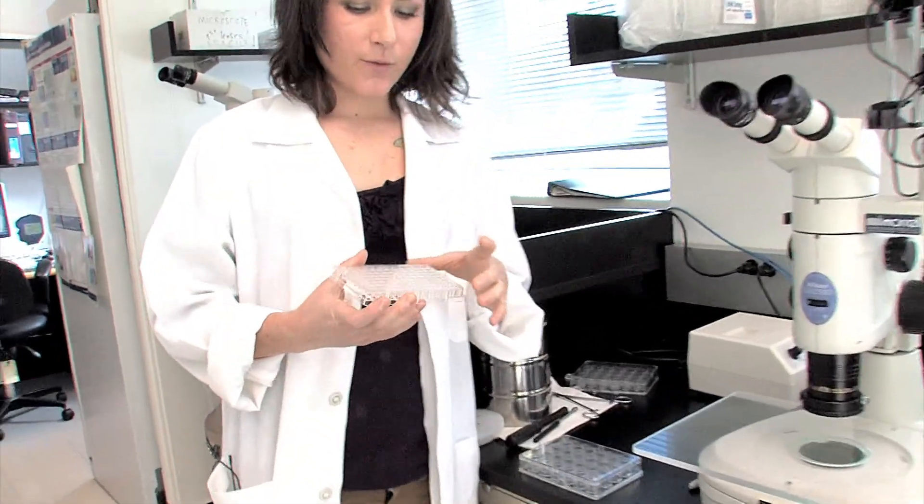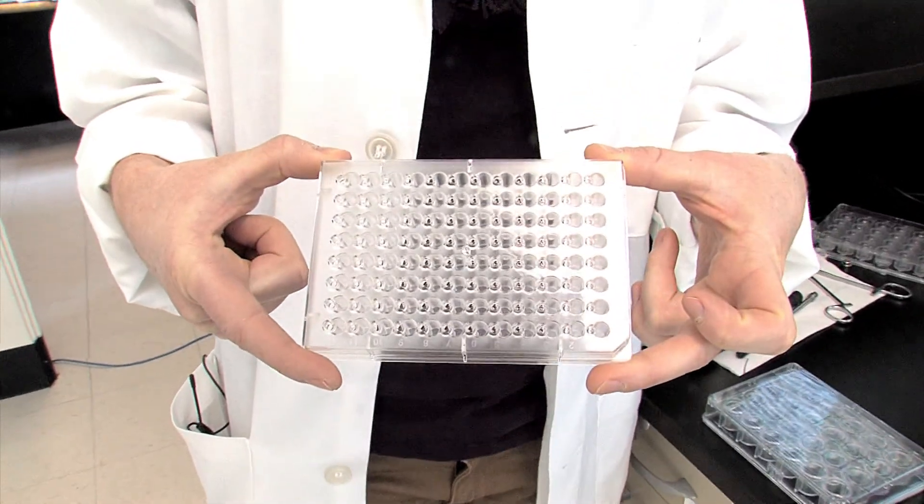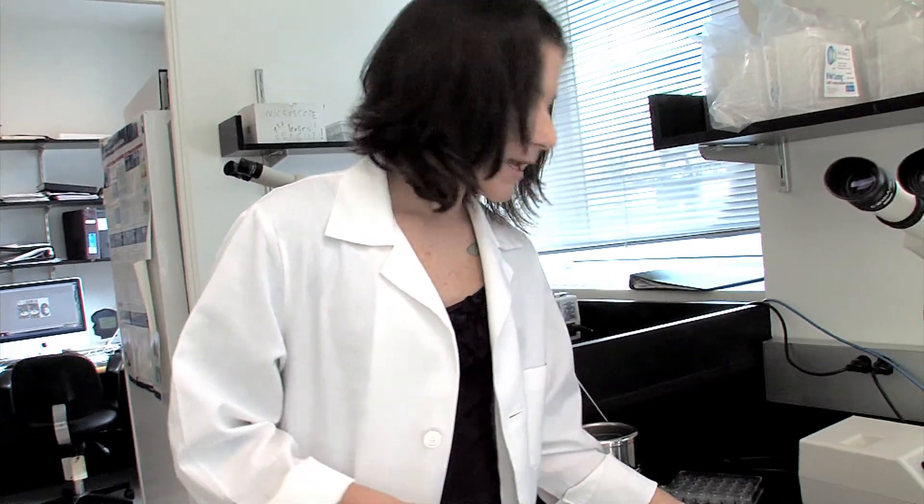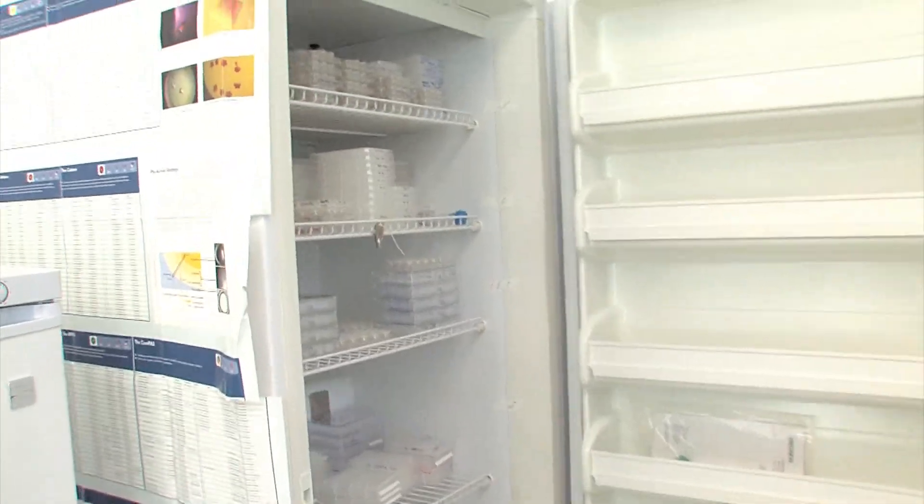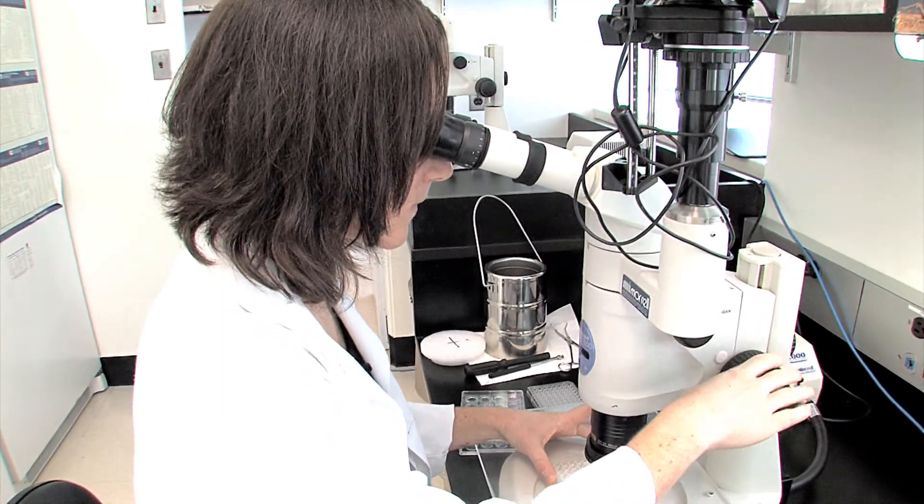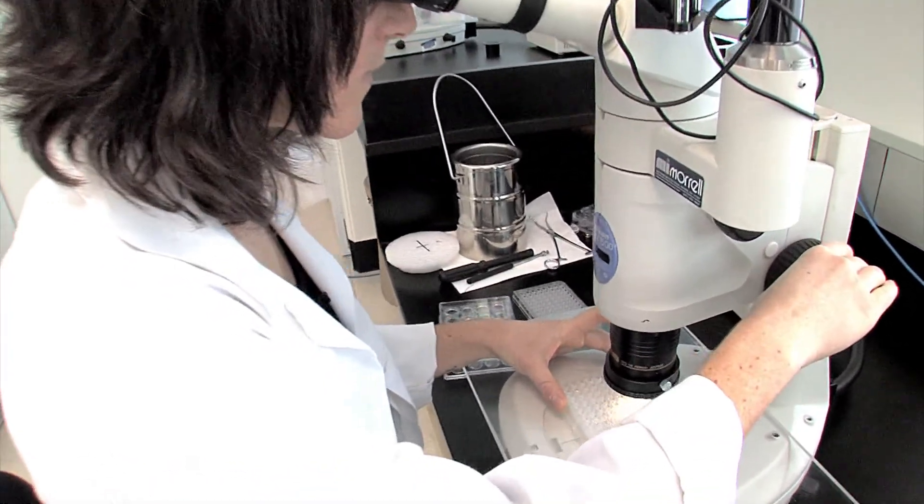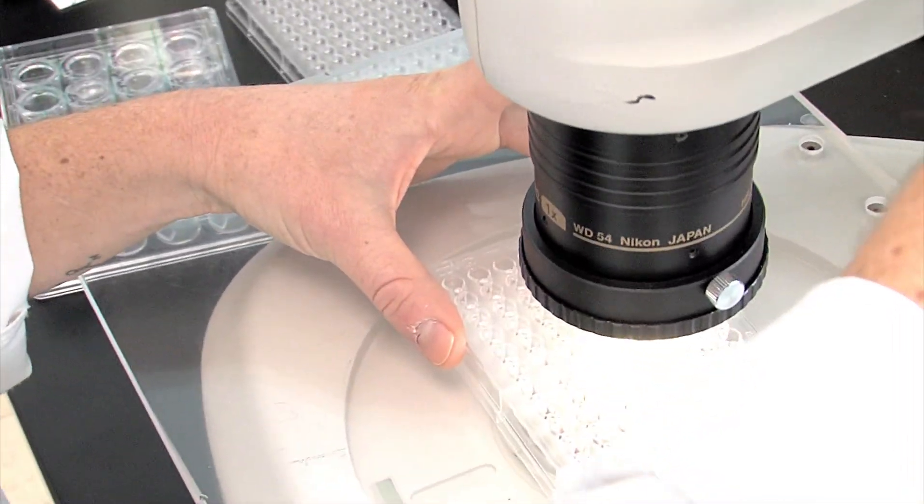We do this by screening through hundreds of different crystallization conditions in these 96-well plates, and we store them at various temperatures, either at 4 degrees or room temperature. Crystals then end up growing in these little wells on these plates. And we can look at these crystals under a microscope. Sometimes they're big enough to see with the naked eye, but most of the time they're so small that we need to use a microscope to see them.